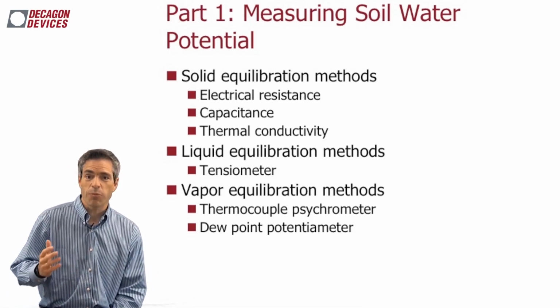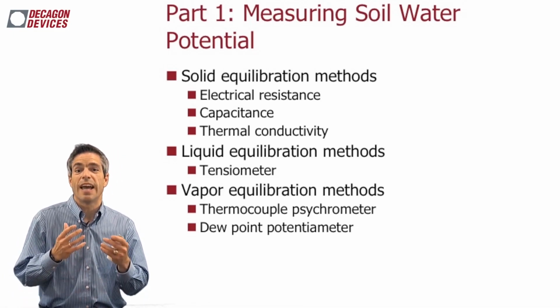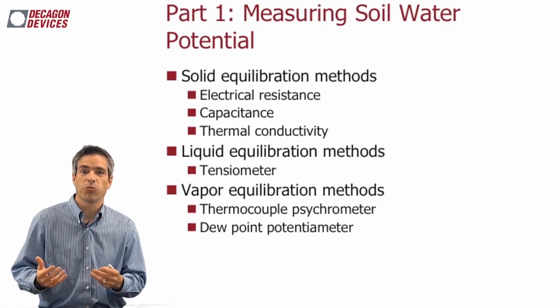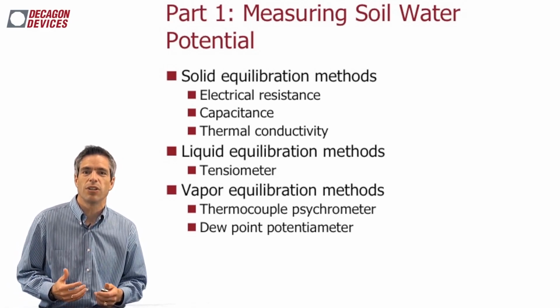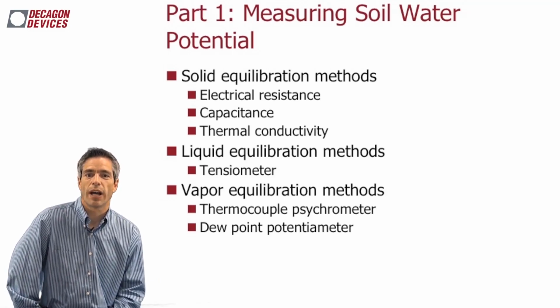Now, there are basically three types of measurements we're going to talk about. Is it an exhaustive list? No. There are other techniques. I'll even mention a couple later on. But really, these are the techniques that we use. These are the things that I've used in my own research. And these are the techniques that most labs and most research around are actually using. So these are the ones we're going to talk about.